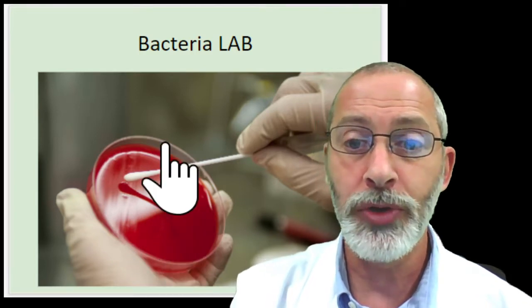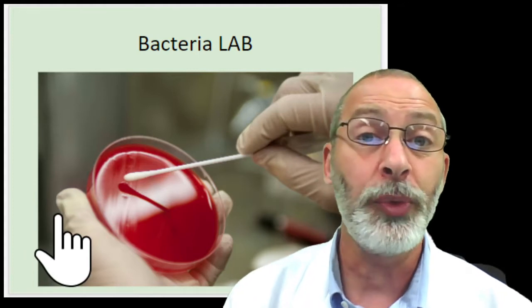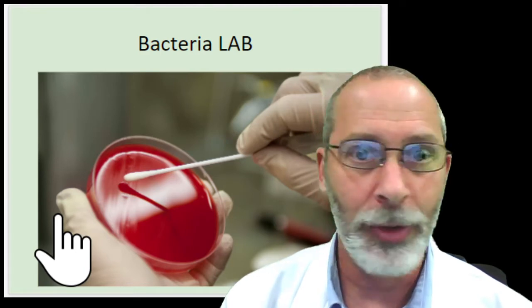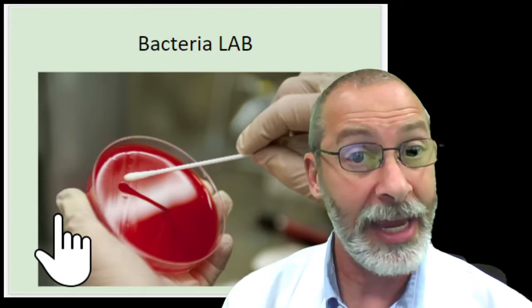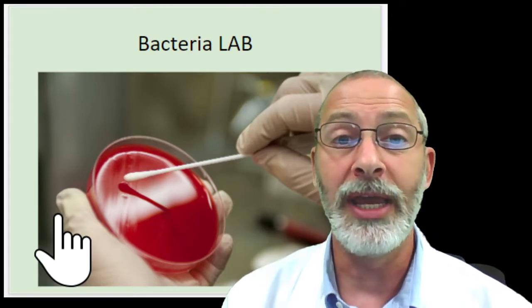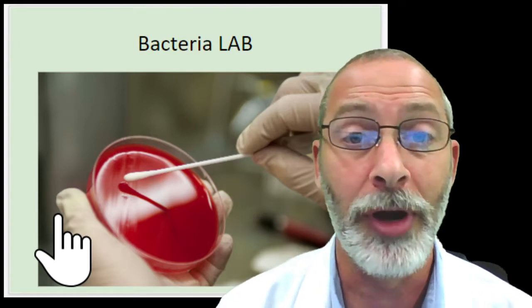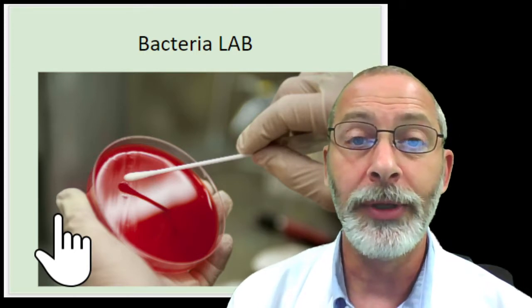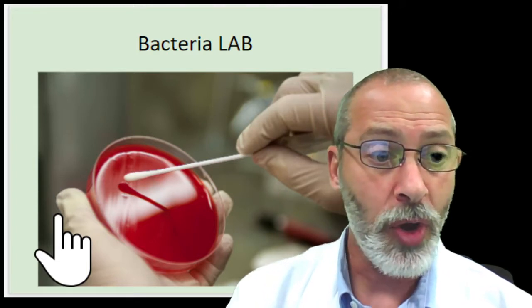Then we would close up the petri dish, tape it up, put it into the incubator, wait 3 days, and then open the incubator, but don't open the petri dish, and examine the petri dishes with our unaided eye and then on the stereo microscope in order to get a close-up view of the various little organisms that we collected from around the building.